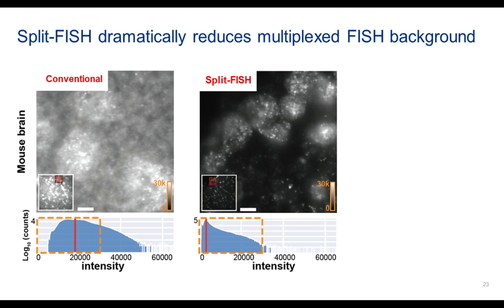With this, we were really surprised that the background is drastically reduced in multiplex FISH. In fact, when we first saw it, we thought we must have mixed up the sample, that we're not actually staining a library. But the image indeed comes from this pool of oligos.